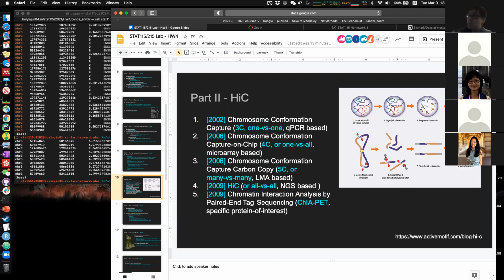So imagine now our input is gene A and gene B fused reads, and two, we know where gene A is originally from, and we know where gene B is originally from, because we have the reference genome. We can map it back to the reference genome. These are the two pieces of information we have, and then the output, the result we want to have.